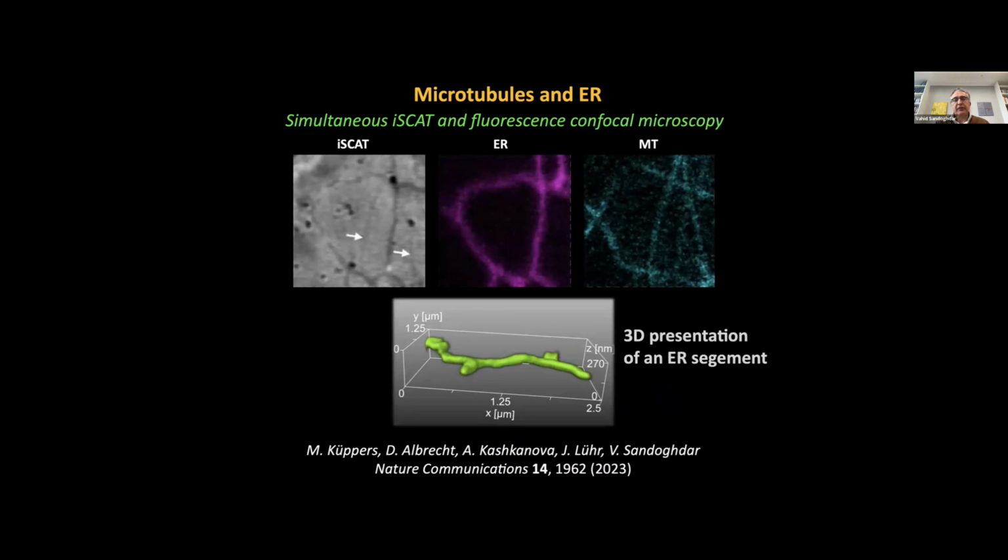Another exciting thing here is that because iSCAT is an interferometric method, we have very good information about the third dimension, much better than the usual confocal axial resolution.